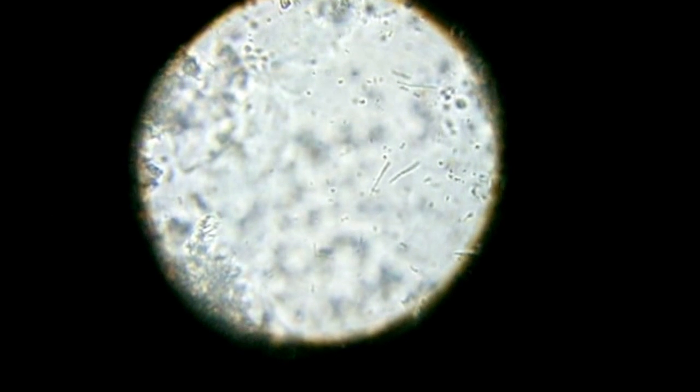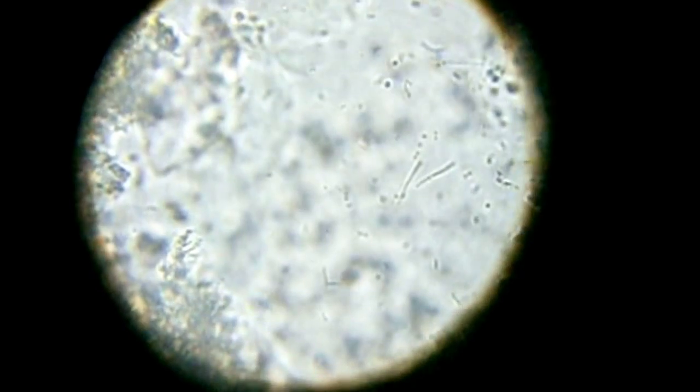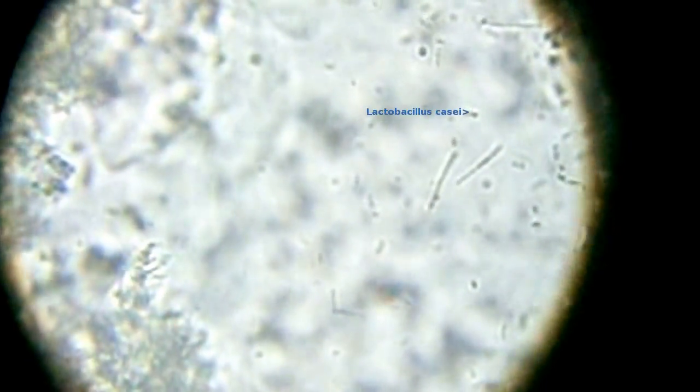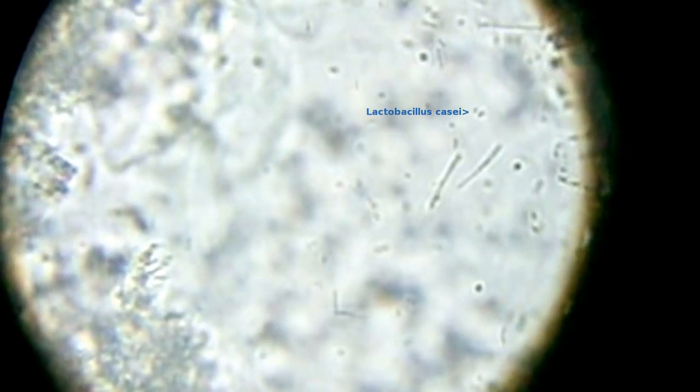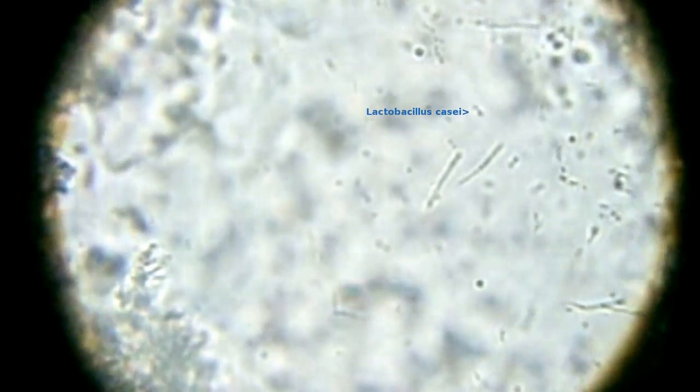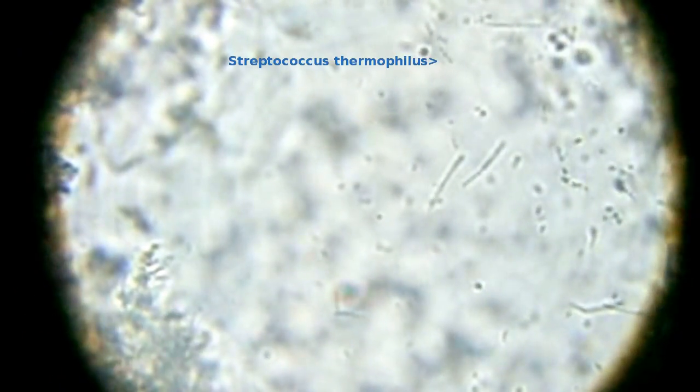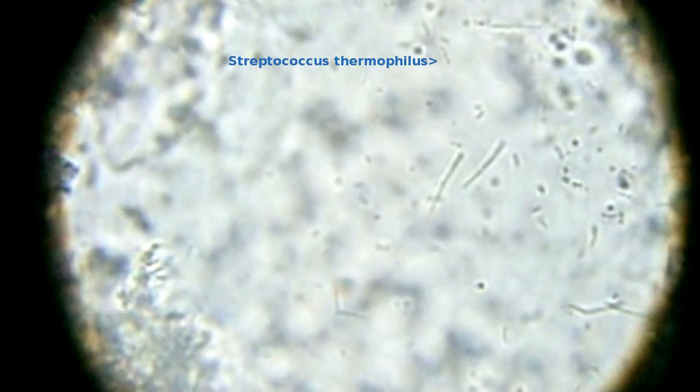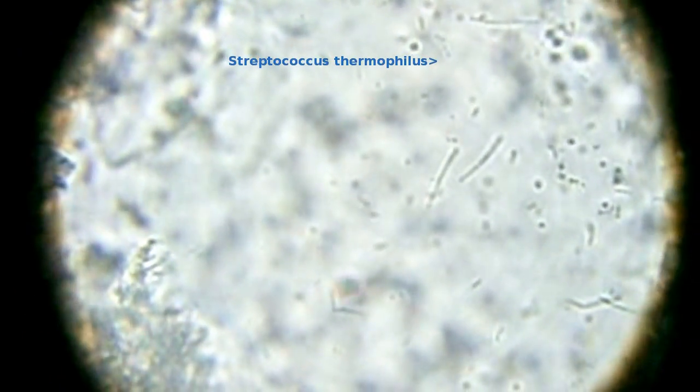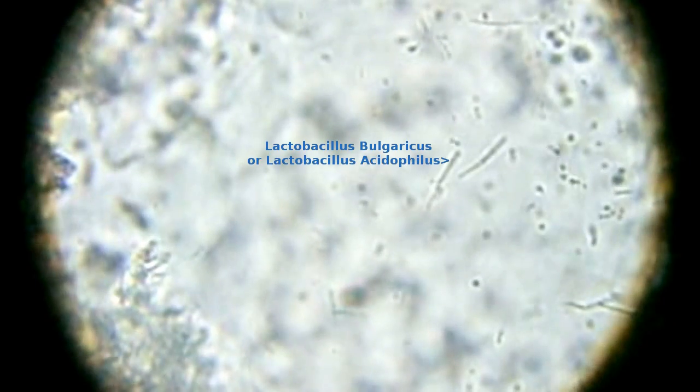Now the magnification I'm using is very high, it's 1,000 times, and I'm using oil immersion. What the oil does between the slide and the 100 times lens is that it allows for much better contrast and a sharper image.